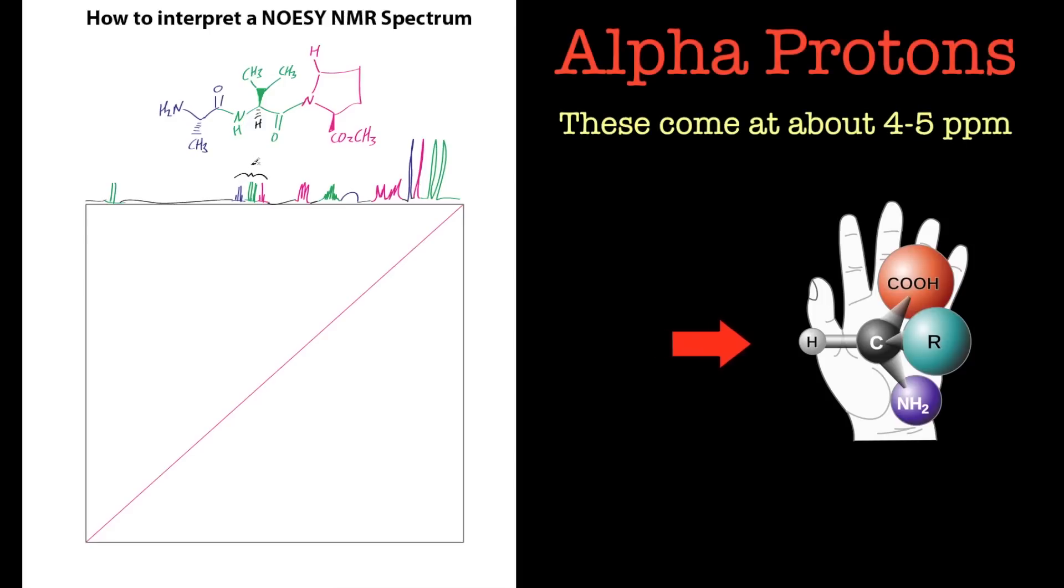These here, this is what you should be looking at for amino acids. These occur between 4 and 5 ppm and these are called the alpha protons, the alpha protons of each amino acid.